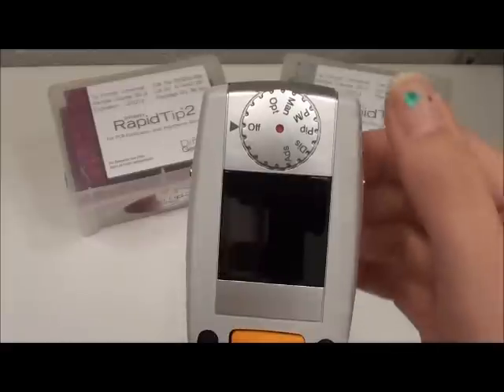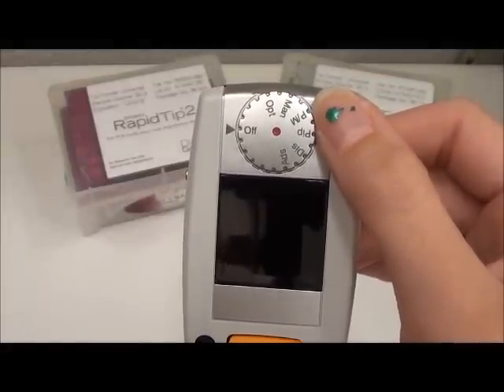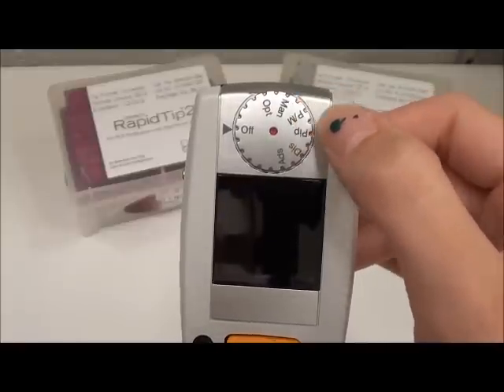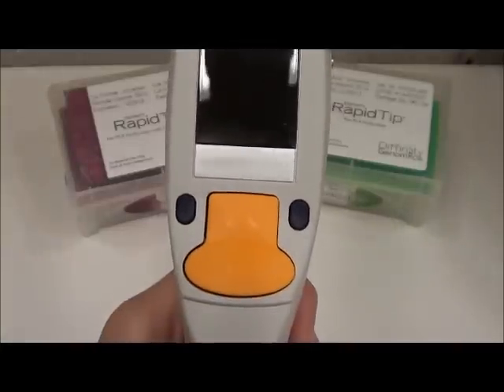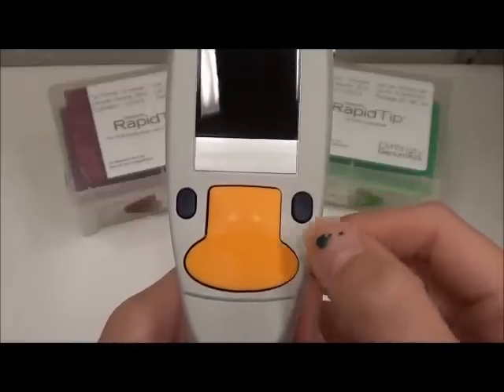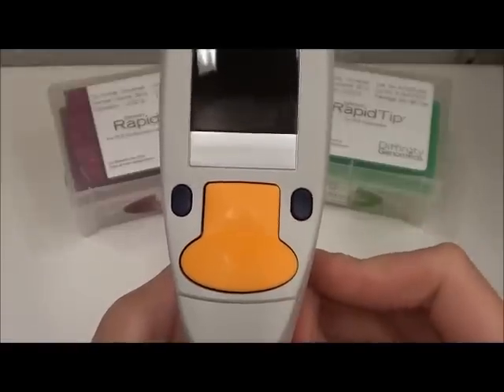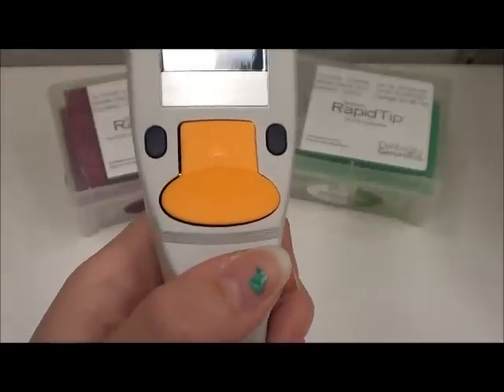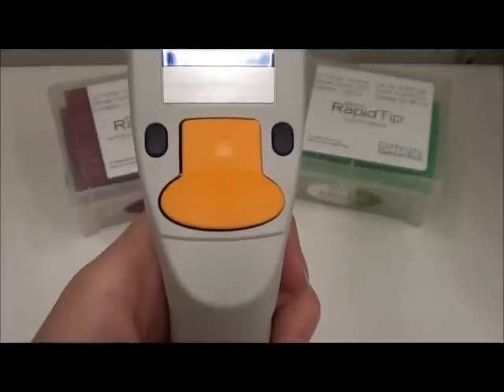First we're going to look at the wheel up here — this is where your options and your different modes are. What we're going to focus on in the pipetting modes is manual and pipette. Down here we have the up and down arrows for aspirating and dispensing. And we have two soft keys, one on either side, and those are going to change functions based on what's on the screen at the moment. And we have the release lever right here, which is going to release your tips from each channel of the pipette.